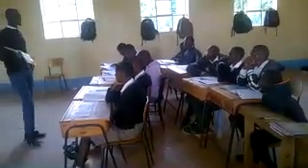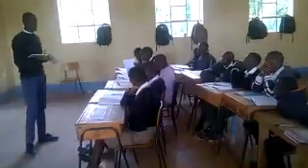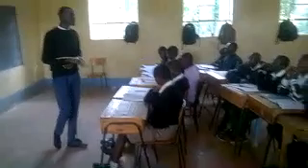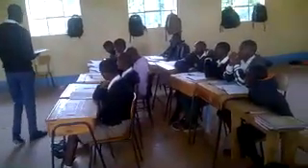Arrange the apparatus as shown. It has been arranged for us. And then they are saying, using a water bath. Do you know the water bath?